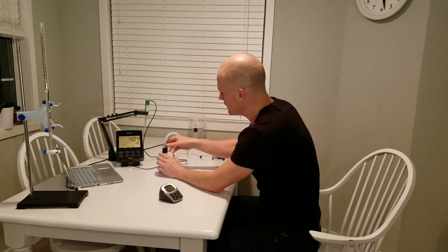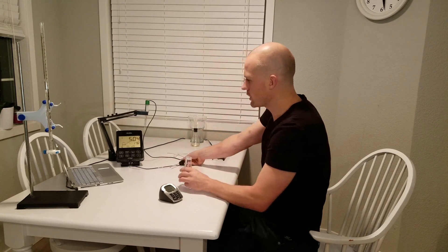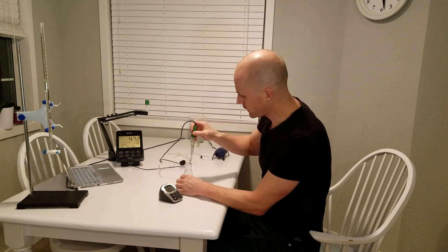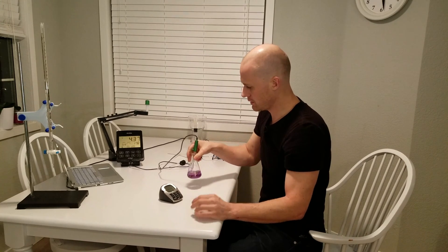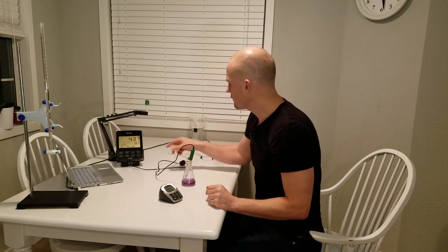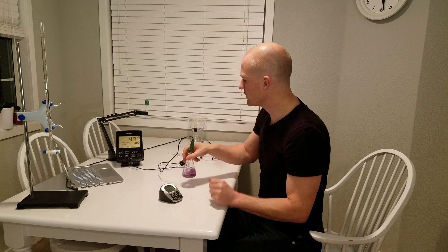That one is not needed anymore. Now we have our reaction here, so this should be more acidic than before because we've been forming sulfuric acid as the SO2 was driven off and mixed with hydrogen peroxide. We can see the pH meter is confirming that we are down to 4.37.